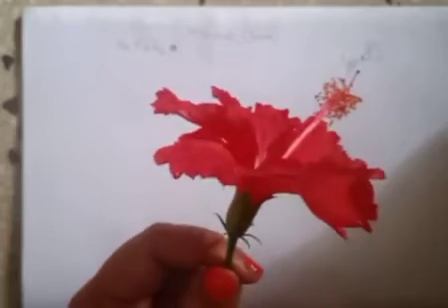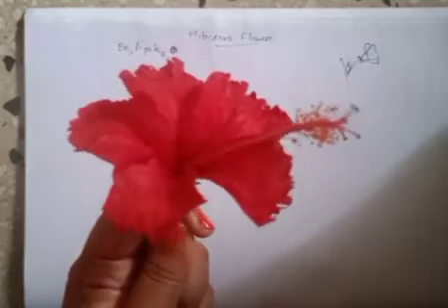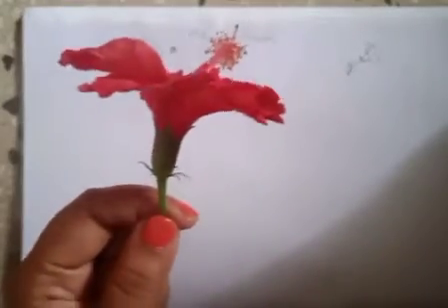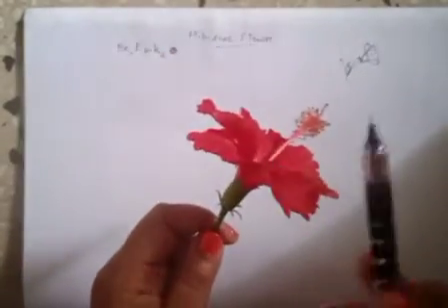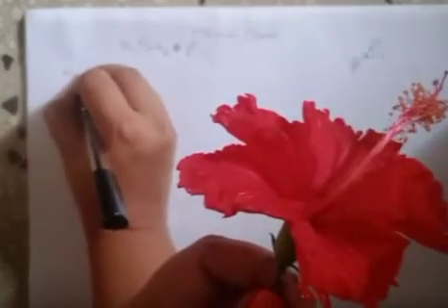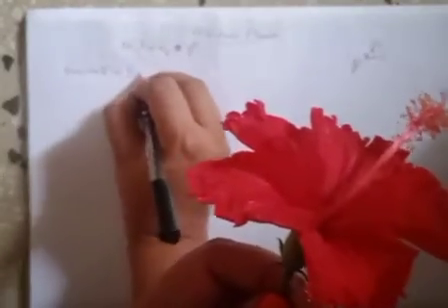Okay, and then after that, what else do I need? After actinomorphic flower, I will write how many calyx I have. But before that, I will write the sexuality. This is having both stamen and stigma, so it is a bisexual flower. Okay, so I have written that it is bracteate. Remember, it is bracteate. So bracteate, I have placed as BR.